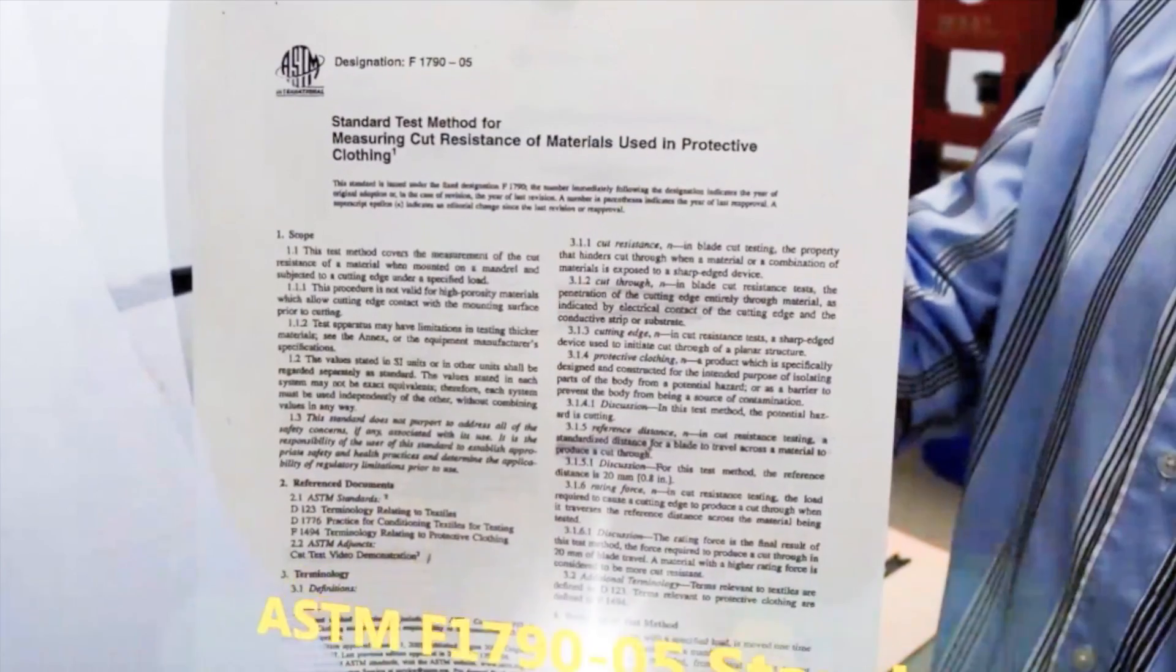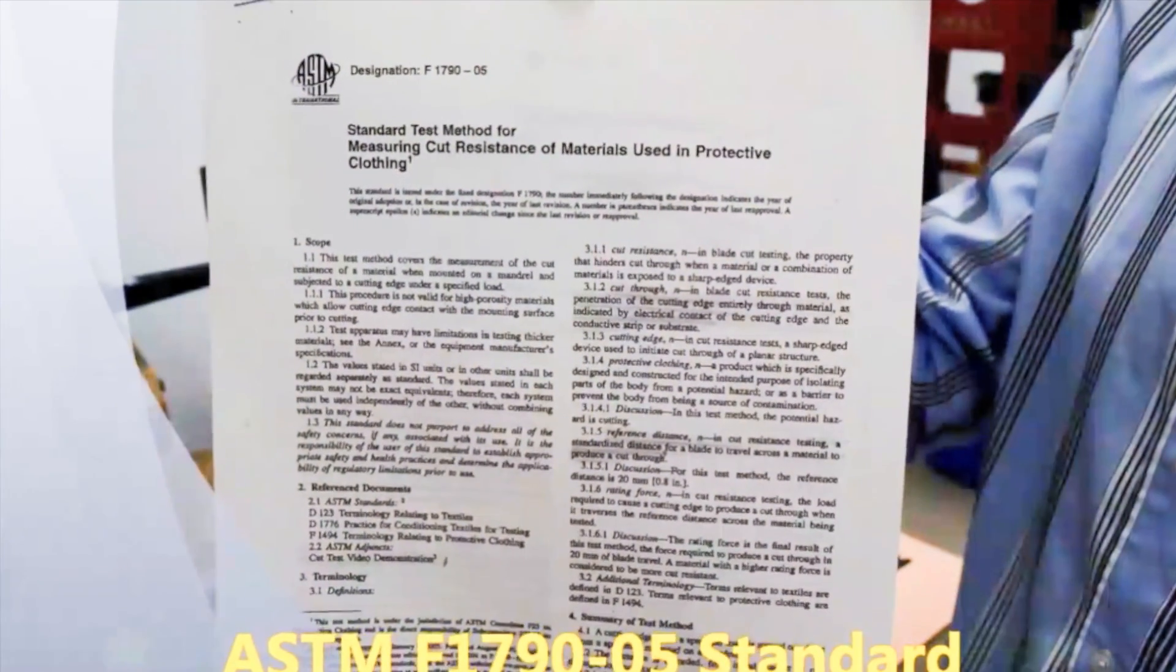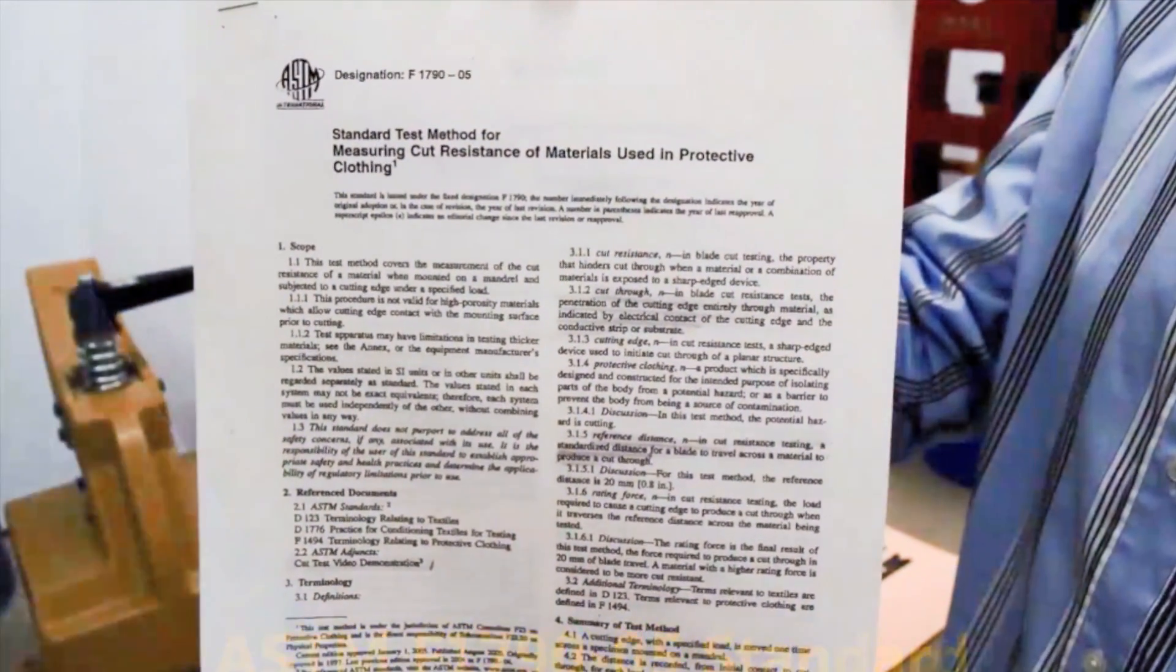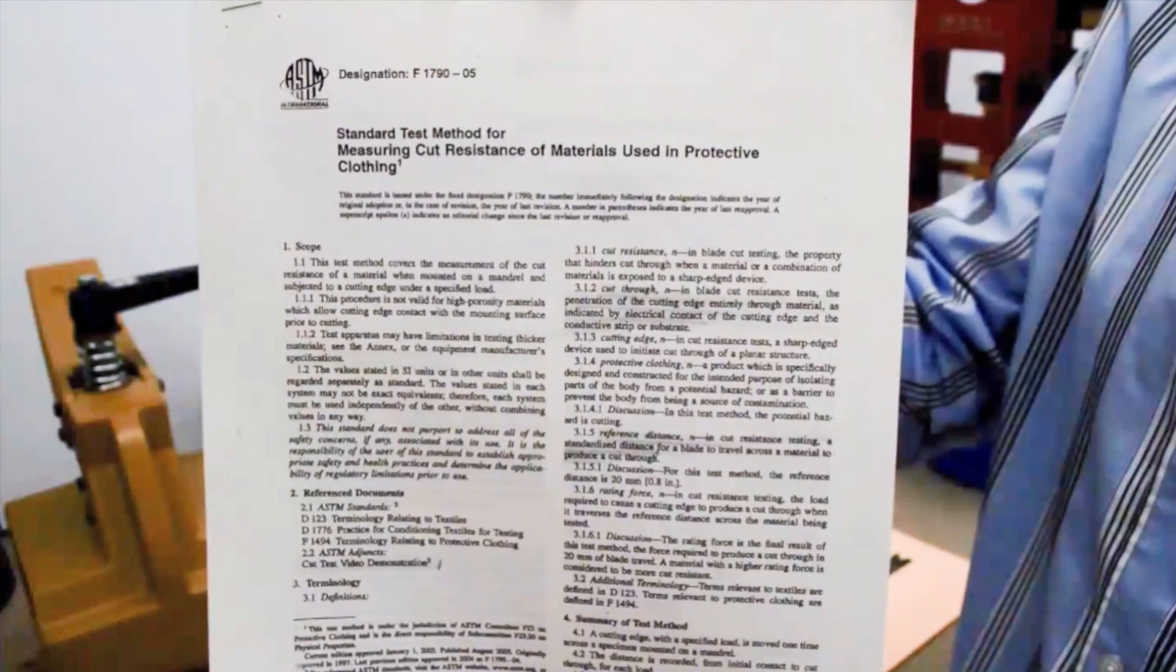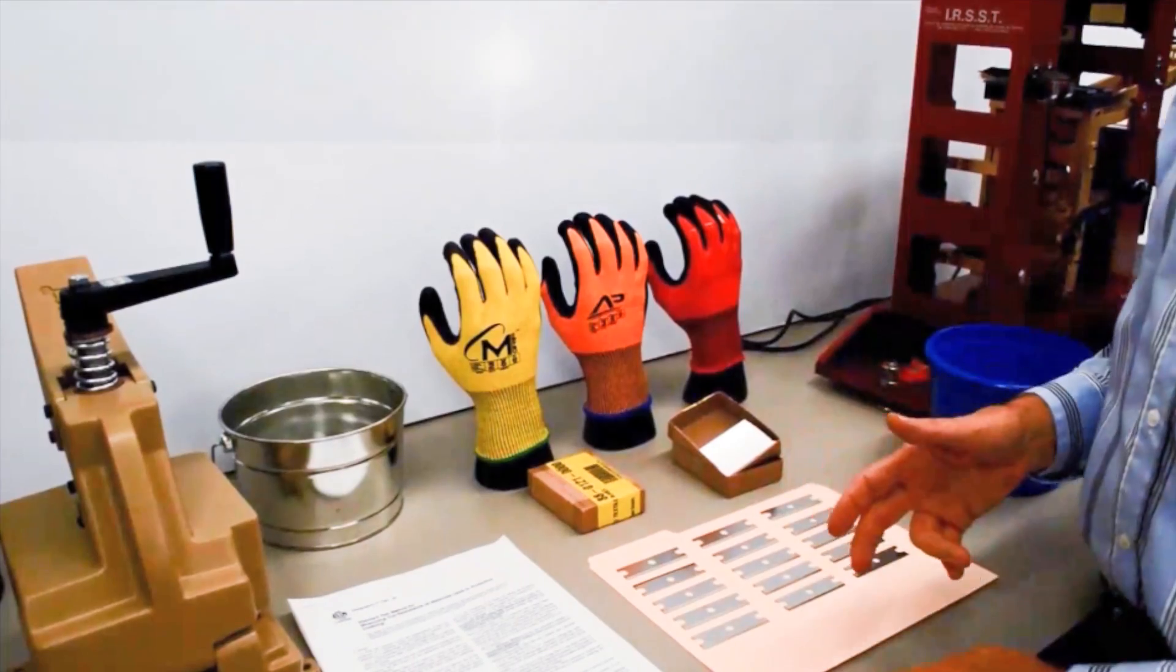In North America, the ASTM F1790 is the accepted test methodology for doing cut resistance testing.